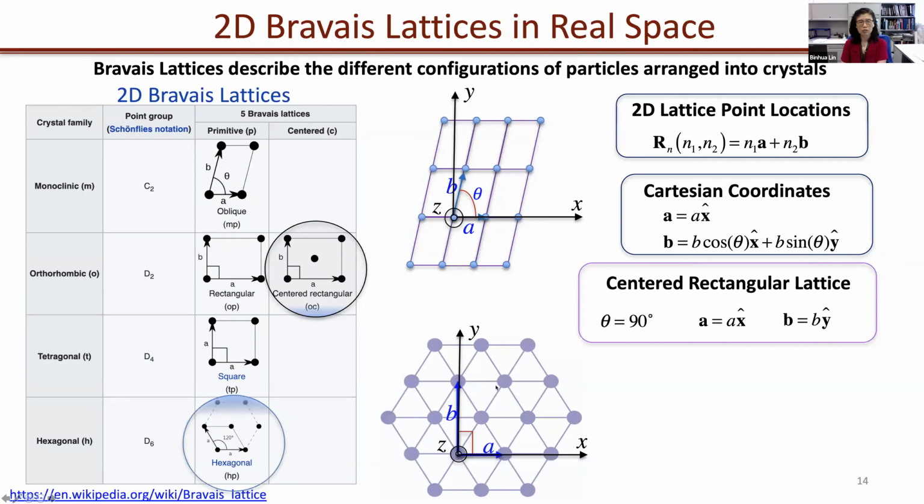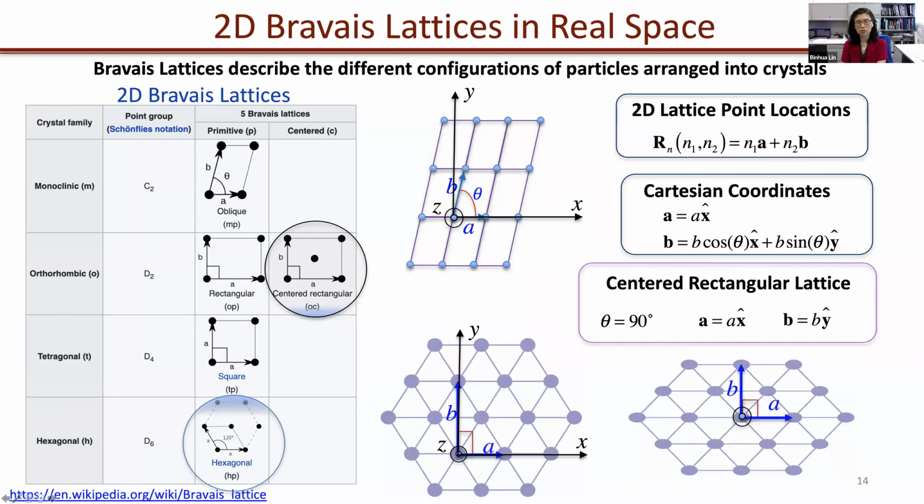Most of their structures are either hexagonal or distorted hexagonal, occasionally square or rectangular. I should note that in order to describe a hexagonal lattice with a centered rectangular lattice, you need to include 2 particles in your unit cell: one at the origin and one at the center.